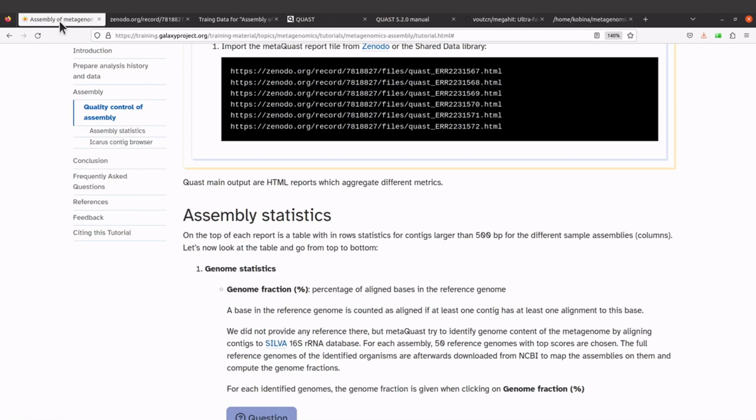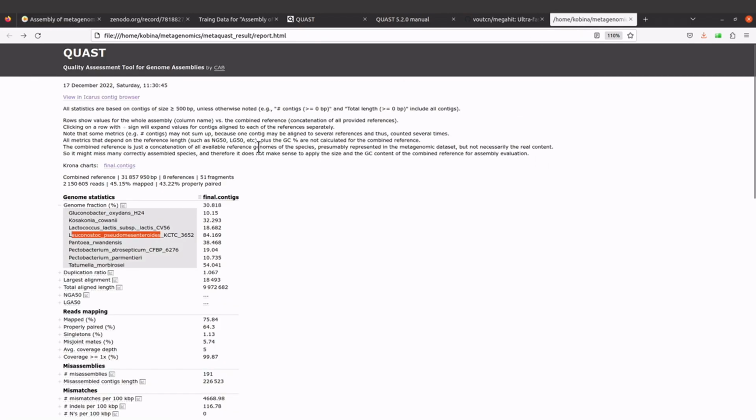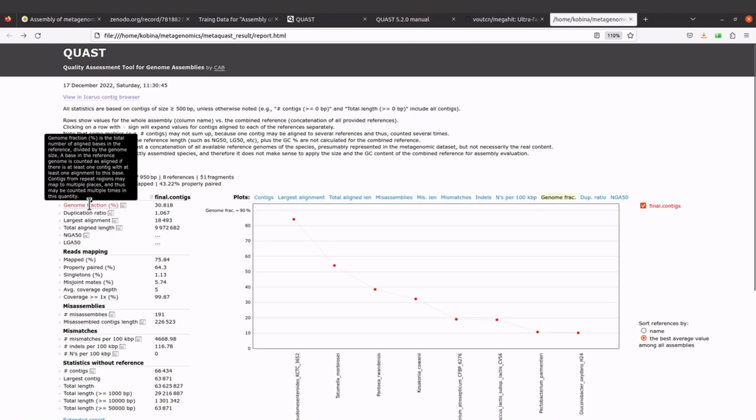And that is what has been given here. Let's just check. That is what has been given here. So things are looking good. You see here it says 84.4%, and here it says 84.169. So they are pretty close. So that's also good. So we can click it back, and then the breakdown will be hidden.